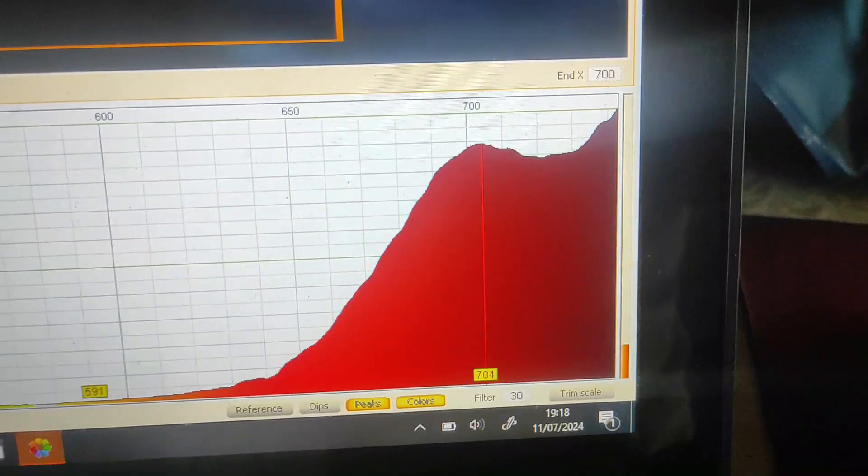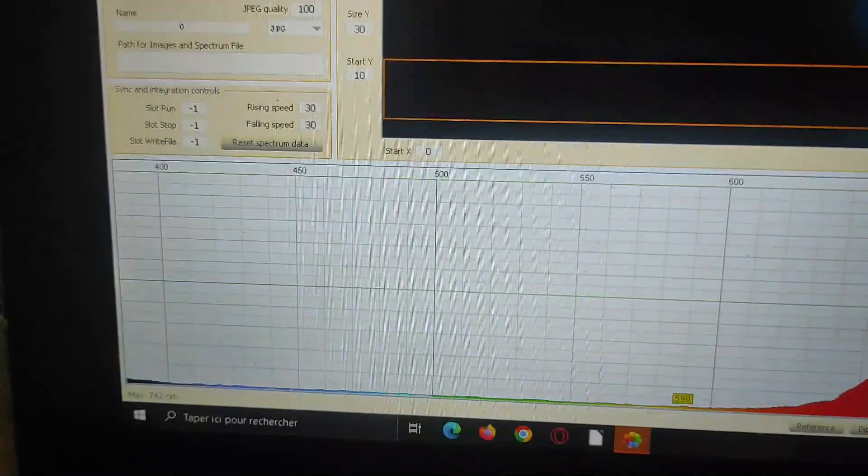As you can see, the red fluorescent peak is observed at approximately 700 nm, which corresponds well to the dark red color we see.